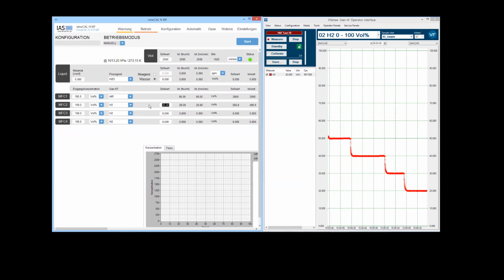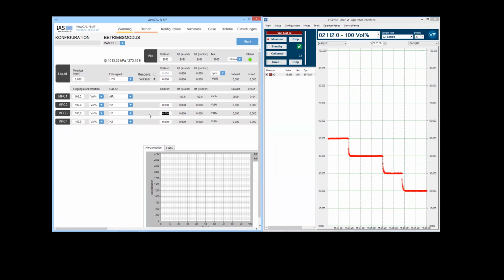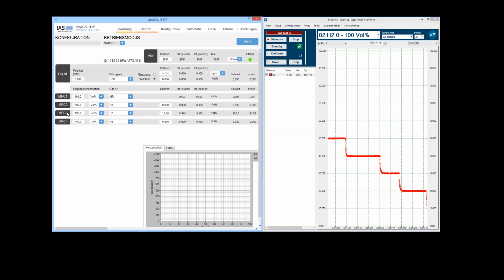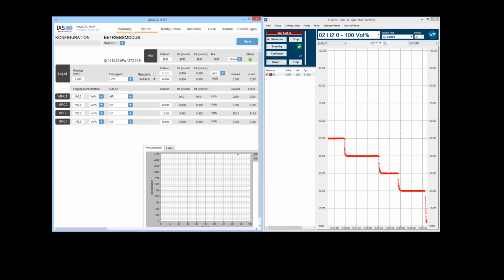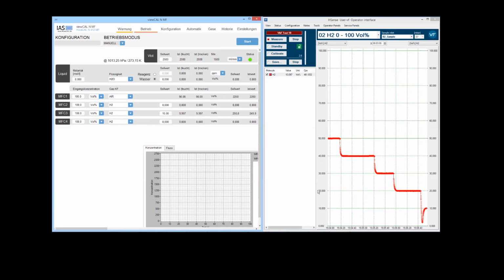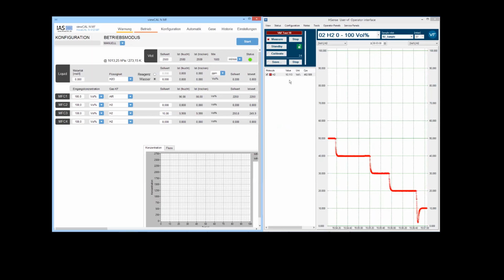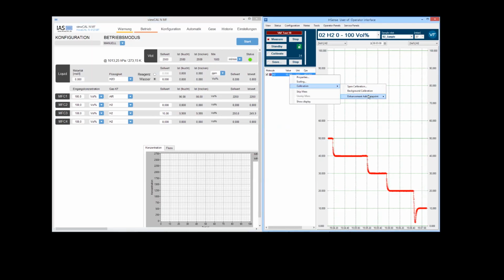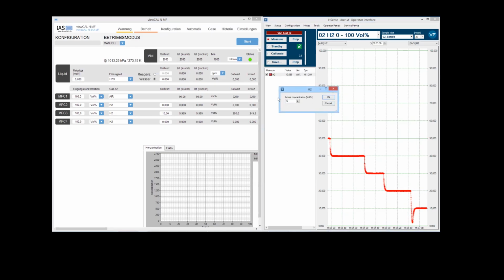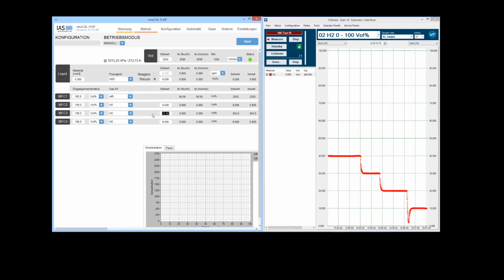So what we're going to do now is switch off this mass flow controller, and the next concentration, which will be 10, will be applied on mass flow controller 3. And the process remains the same. Now the stepping changes a little bit.